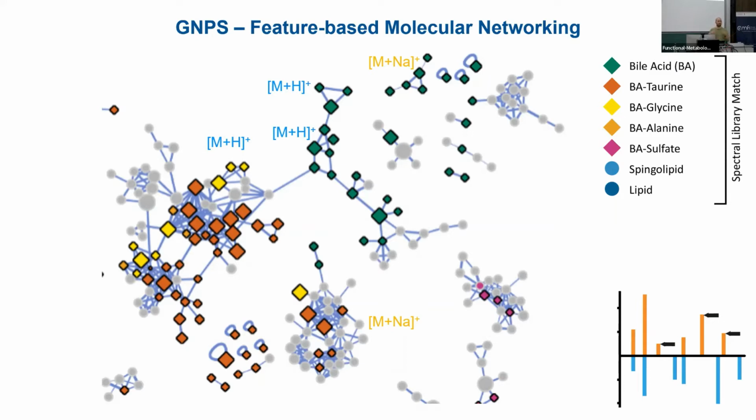Not only height as an alternative way of measuring abundance, but also characteristics like the width of a peak, or the width at half height of the peak, the shape you can report, like the asymmetry factor and things like that. So you can export everything if you want to. We didn't showcase it yesterday, but for advanced users, it's really convenient to have that information accessible.